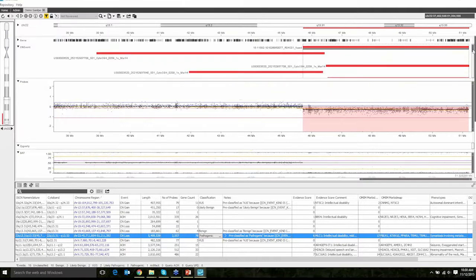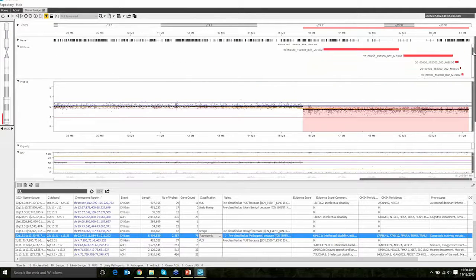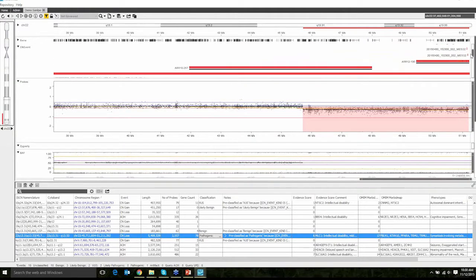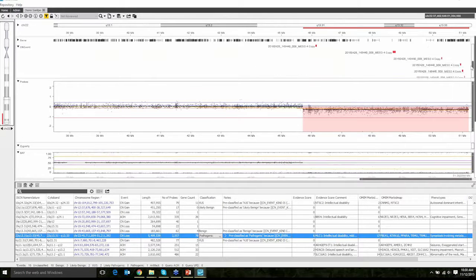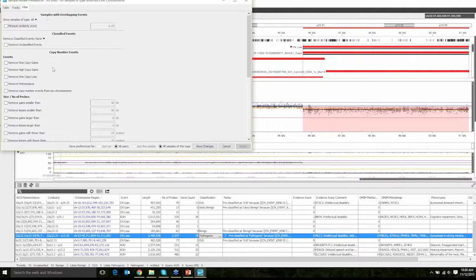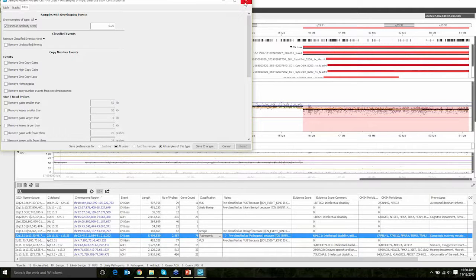So if you look, you can see there's all sorts of small and big and all sorts of crazy things. And they're sorted based on similarity. So the last things at the bottom are the least similar events. Or you can change the amount of similarity that you're looking for. And don't confuse similarity with overlap, because similarity is really similar cases, not just overlapping.